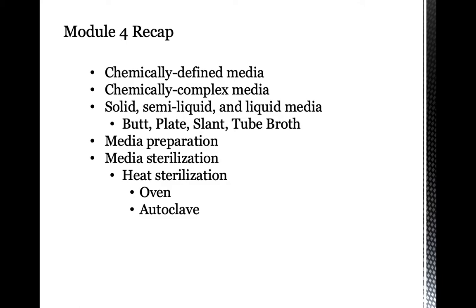For media preparation, I think I have discussed lyophilized medium and compounded medium. There are instances in which you will need to compound your culture medium, meaning you have to create it from scratch. Compounding media is normally applicable for chemically defined types. Say you have your ingredients identified, then you measure specific weights or volumes of each, and then you combine them in the specified volume of distilled water, or whatever your solvent is.